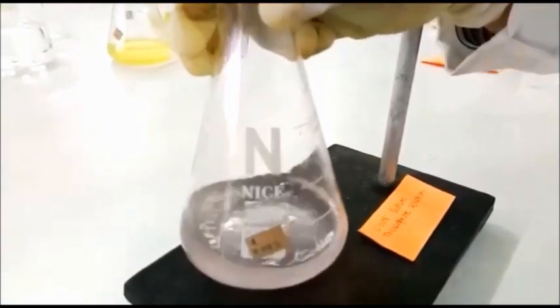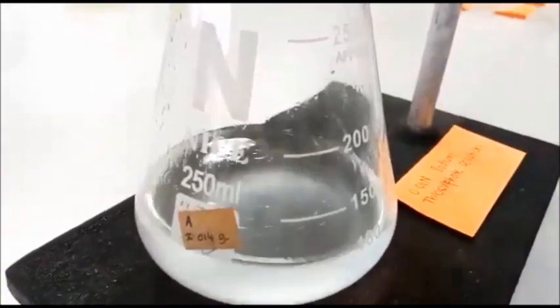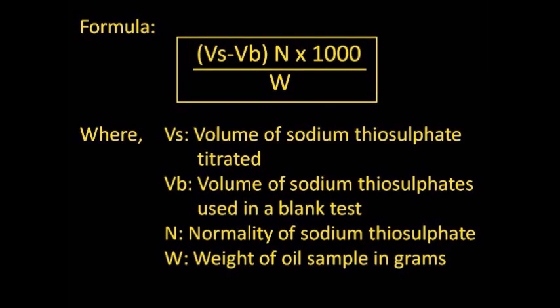The solution will turn from dark blue into a colorless solution. Once reaching the end point, slow down your titration to not exceed the end point. The final mixture will look as such, a colorless solution.